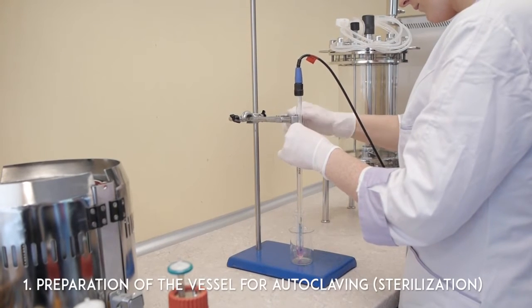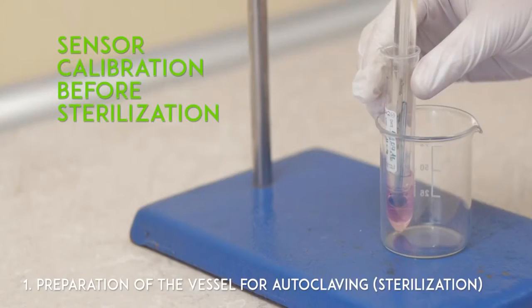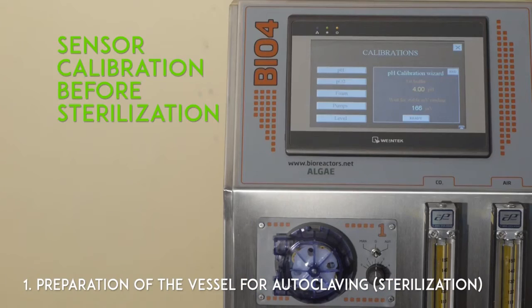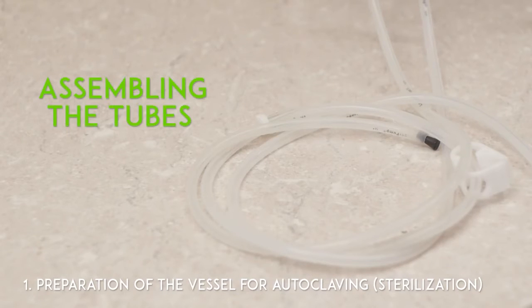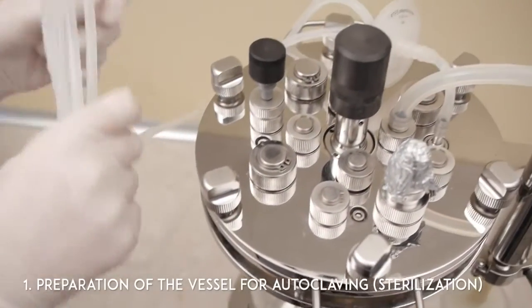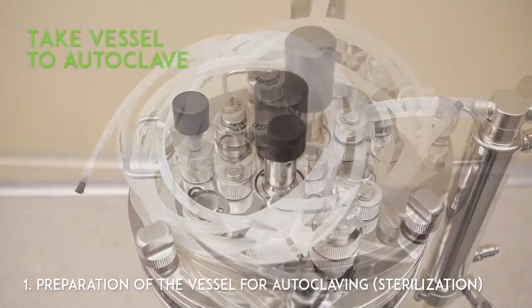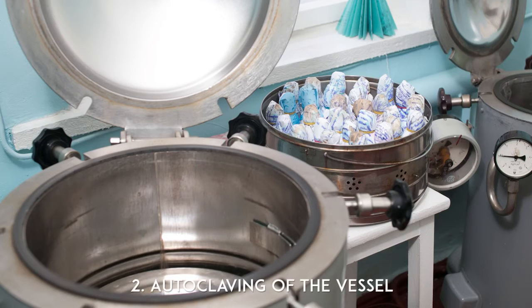Preparation of the vessel for autoclaving. Sensor calibration before sterilization. Assembling the tubes. Take vessel to autoclave. Autoclaving of the vessel.